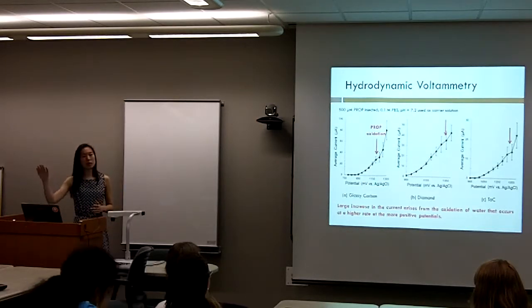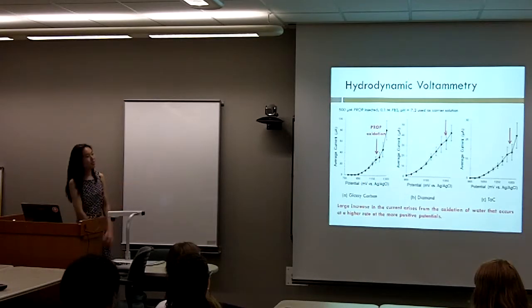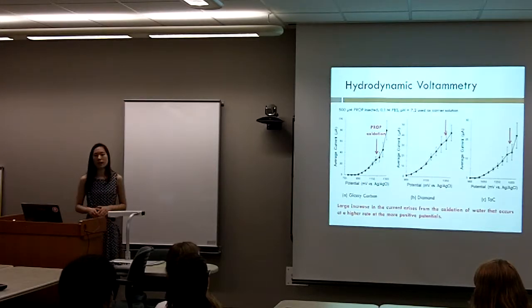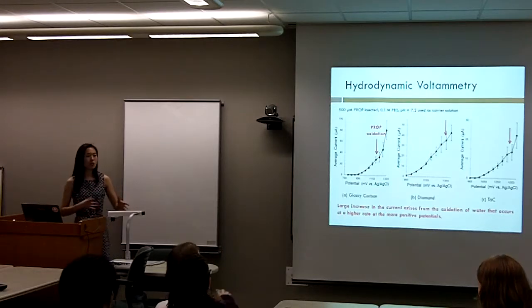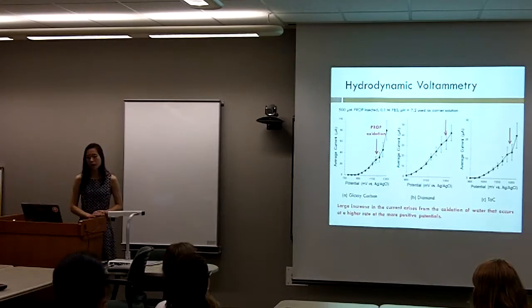And when it starts to plateau, we know that that's where propranolol oxidation is maximized. But you might ask, in these graphs, it kind of plateaus and it shoots right back upwards. And this large increase in current is probably due to the fact that other things inside of my carrier solution, maybe water, is getting oxidized. So that's why the current is increasing so fast towards the end.